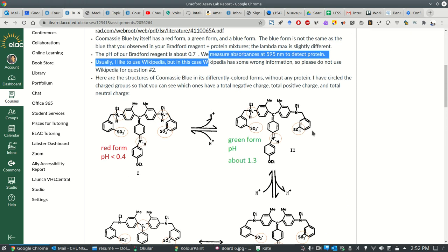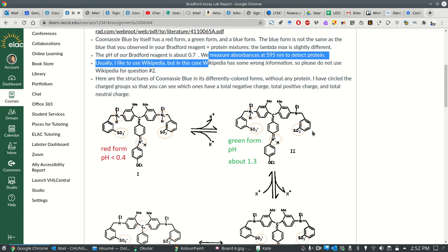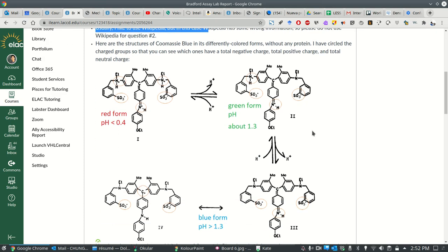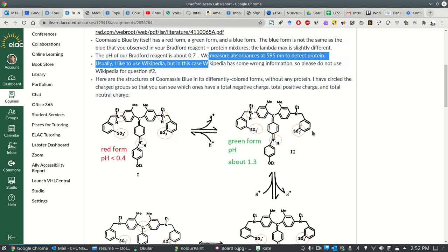221, I'm getting some very good questions in email and the discussion forum about the concepts behind the Bradford assay. So this is the Bradford assay. I wanted to make this video to help you to see what is going on here.